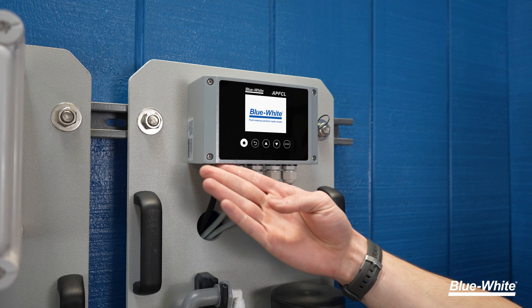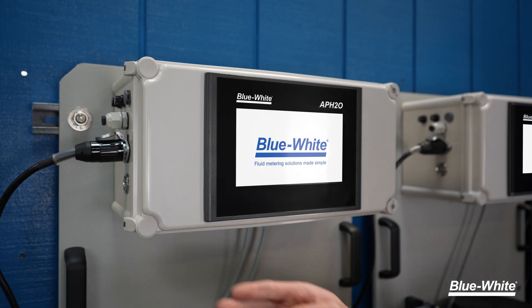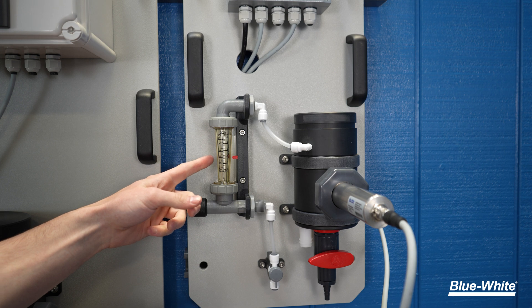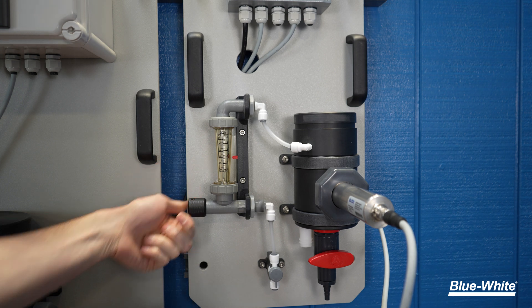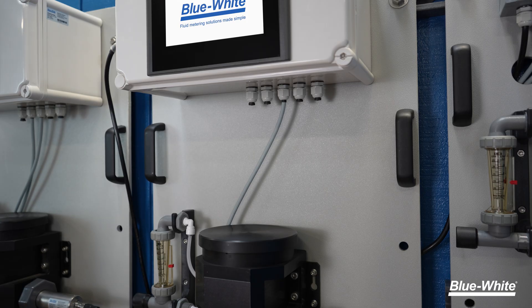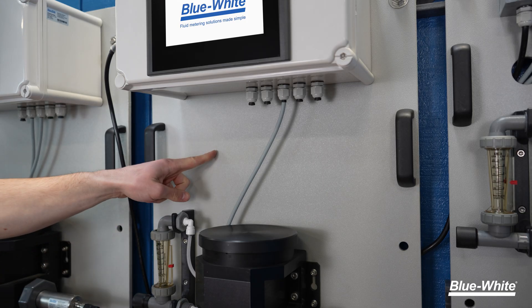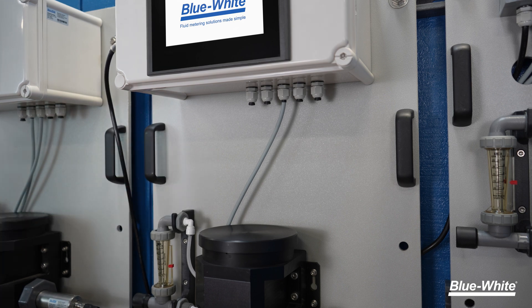We've equipped the APFCL with a 2.8-inch digital display, and the APNTU and APH2O are both equipped with a 7-inch touchscreen display. We've fitted all three analyzers with a Blue-White F440 adjustable flow meter to accurately regulate the intake of fluid into the reservoir. And we've constructed the rear panel with a chemical-resistant polyethylene with two sturdy handles to allow for simple installation.